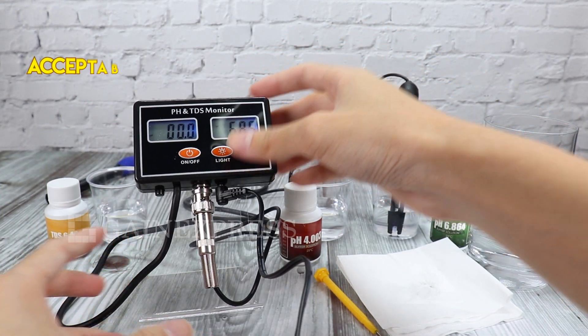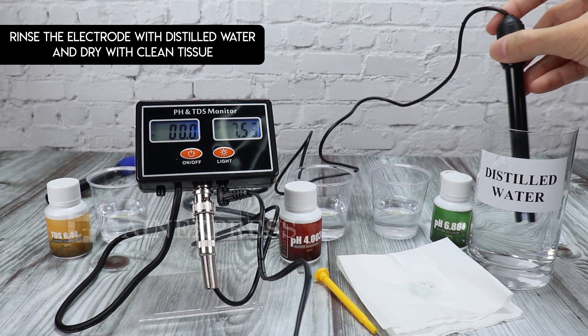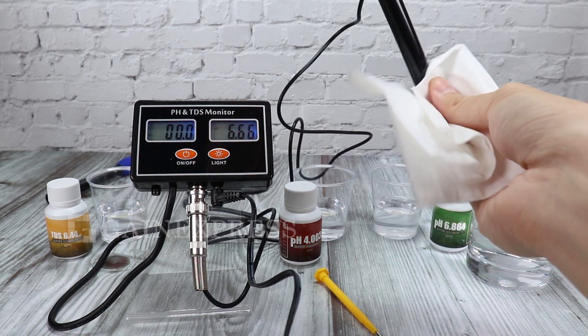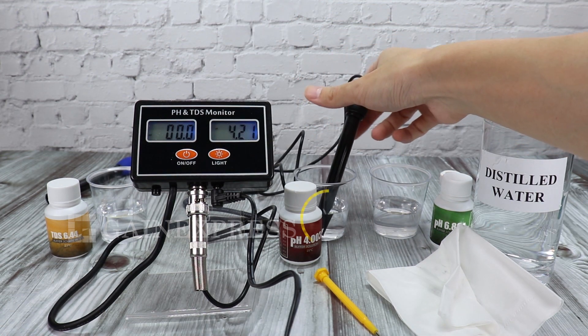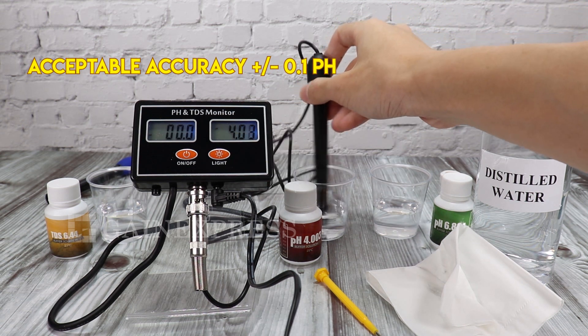It is acceptable if the display value is within the error range. Rinse the meter with distilled water after every use. Put again in the 4.0 solution for immersion. It is acceptable if the display value is within the error range.